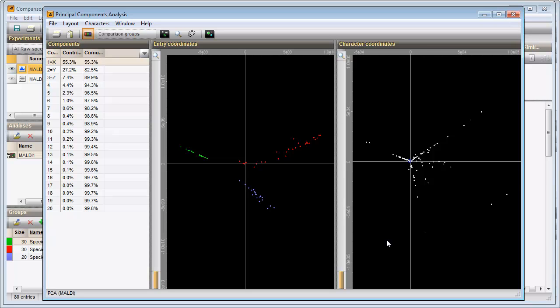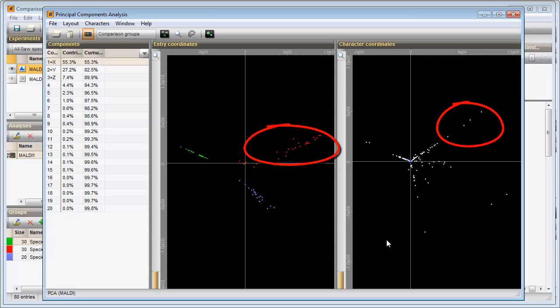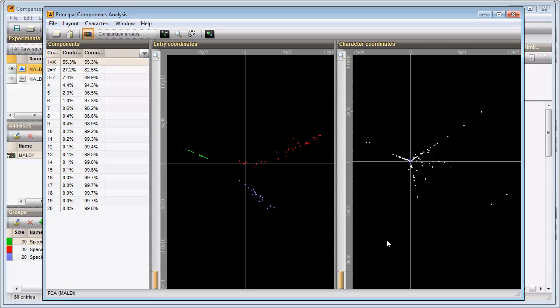If you look at the entries for Species A for example, they are all found in this quadrant. This group of peaks is located in the same quadrant, meaning that they are likely linked specifically to Species A. The same can be seen for Species B.